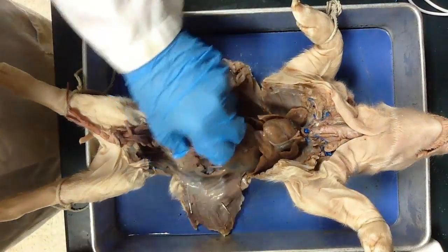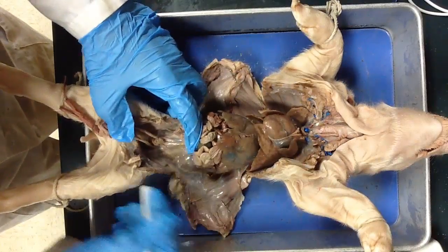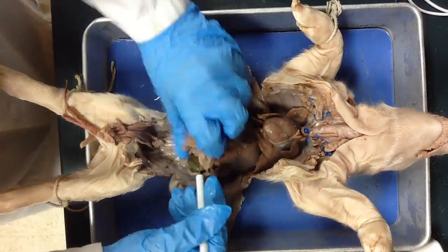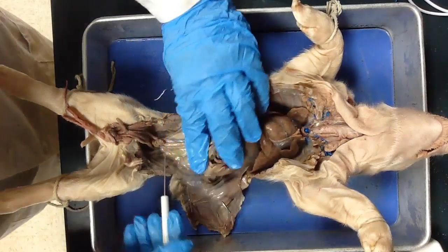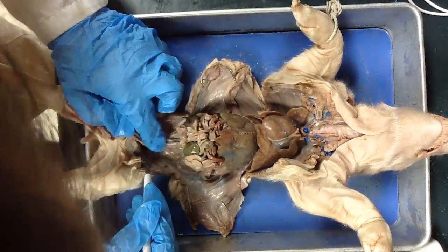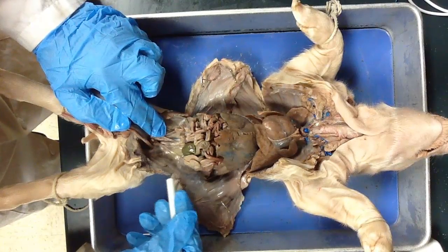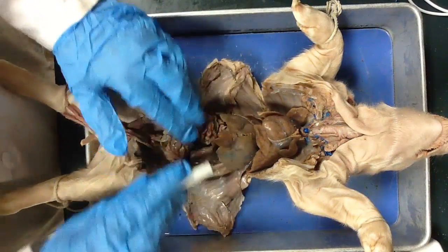Then you have the rectum. The rectum is going to deliver the solid waste out to the anus. The rectum normally is quite full of green gookiness in your pigs, but it does not appear to be in this pig. This appears to be our pig's rectum right here — that's that tube. Yours is probably going to be nicer, fatter, and greener. Then you have the liver, which you've already identified.